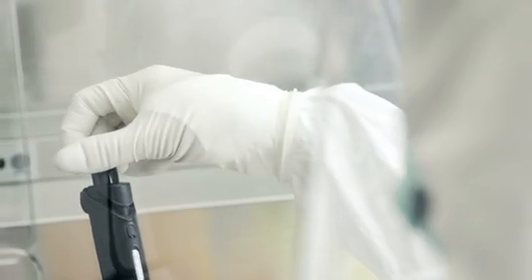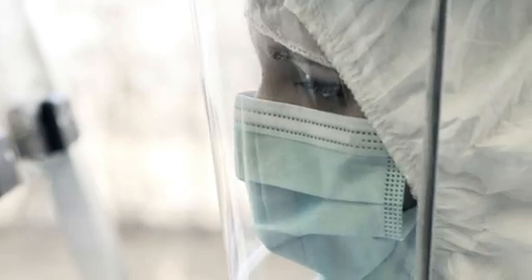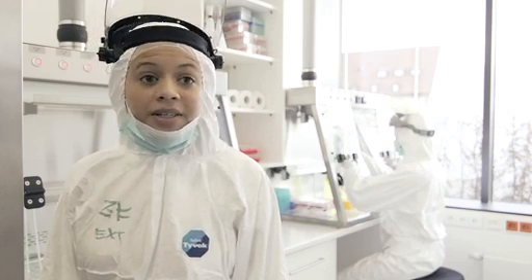As I said before, DNA in bones is preserved in very small quantities. Here we set up PCRs, a reaction to amplify the very few remaining molecules, and create DNA libraries.